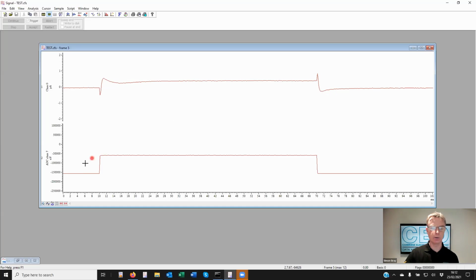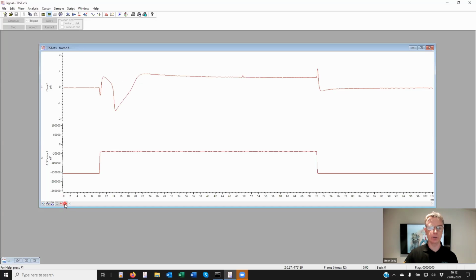So we can work out, given a given height of stimulus pulse, exactly what response, what current trace we should expect if the cell hasn't responded. And having done that, then when the cell does respond, we can subtract the non-responding curve from the responding curve, and thus remove the leakage and the capacitive transient from the data.